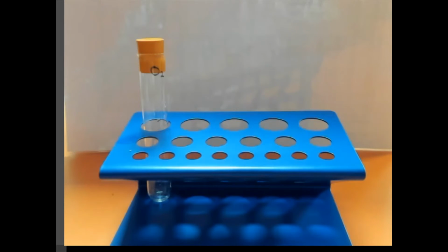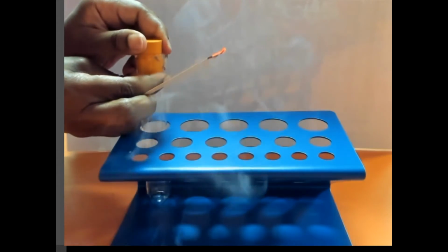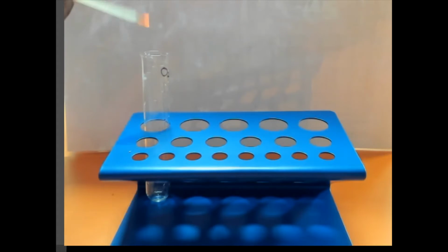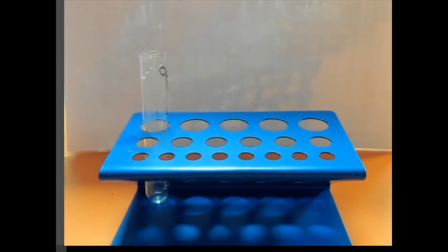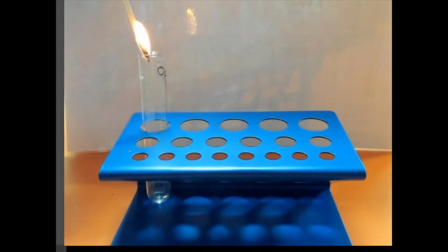Our next test will be the test for oxygen. I'm going to be using a glowing splint. Notice what happens. Oxygen relights the splint. Let's try this again. It's glowing, and here we go. It relights it.